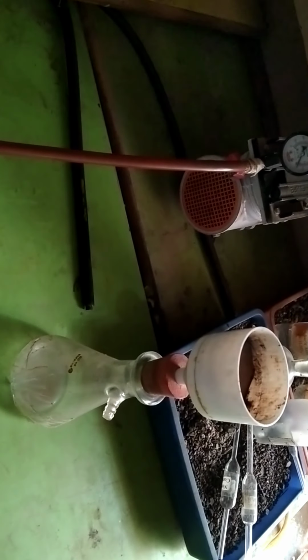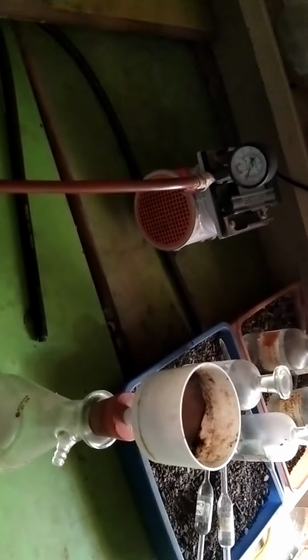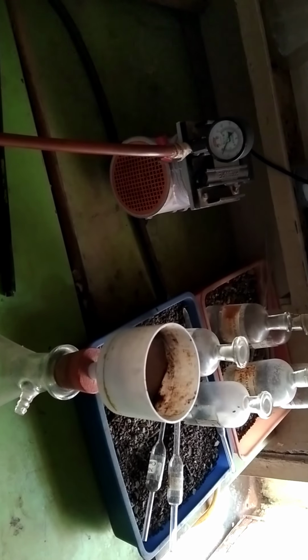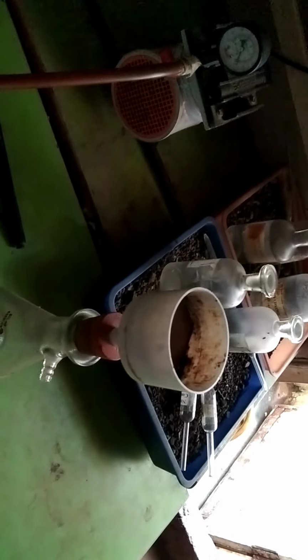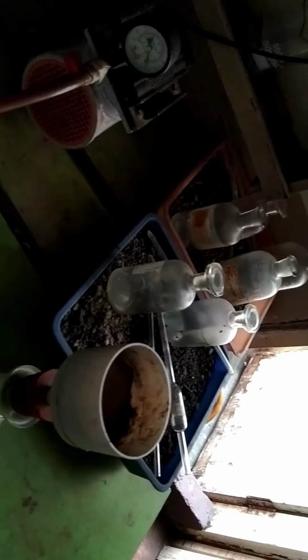Okay, another setup used is called the Buchner funnel with suction pump. Whenever precipitation is there in organic and inorganic practicals, especially in inorganic experiments like gravimetric analysis and in compound preparations, the solids from the solutions are separated.